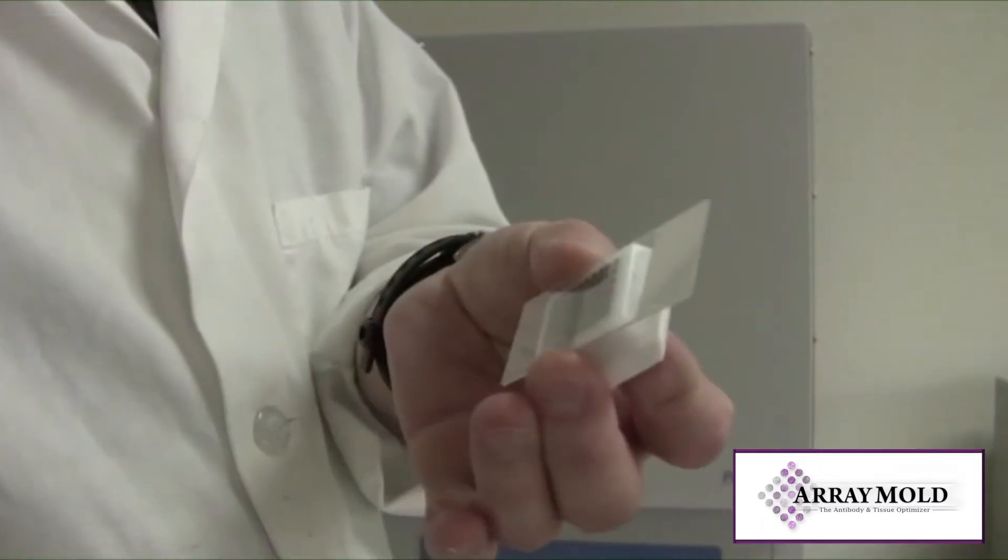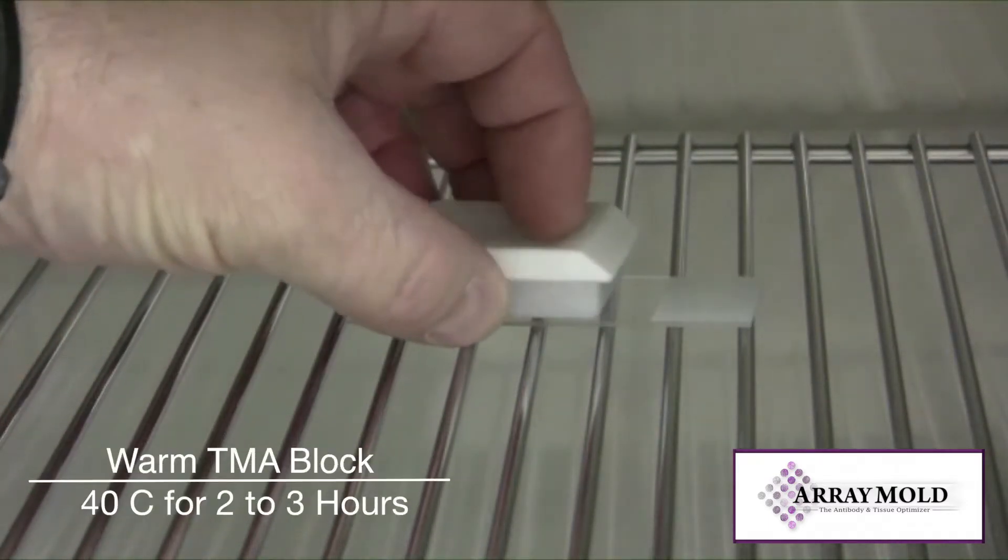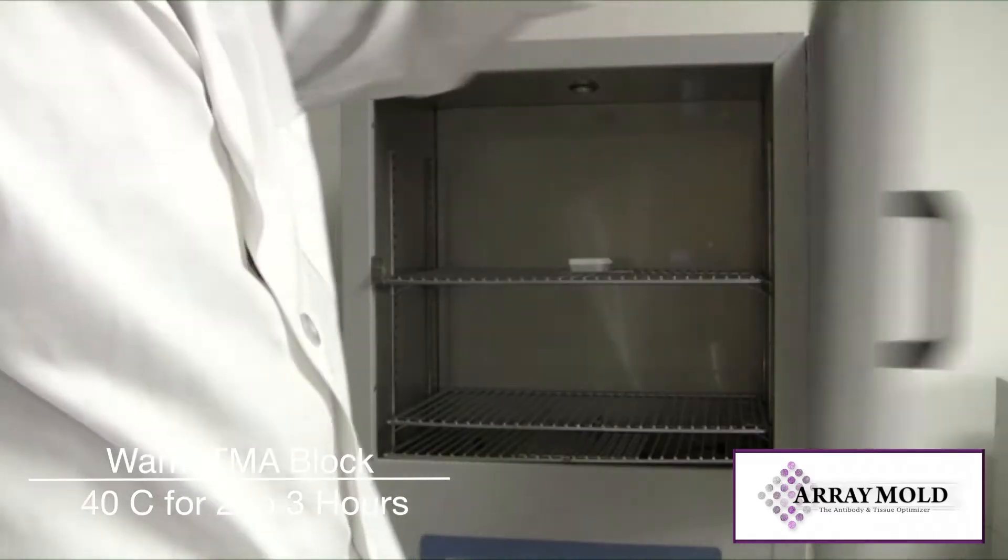Some people like to leave their array blocks in the oven overnight to soften and set the punches, but we have found two to four hours works just fine for us. You may want to test this for yourself because some tissues might need more setting time.